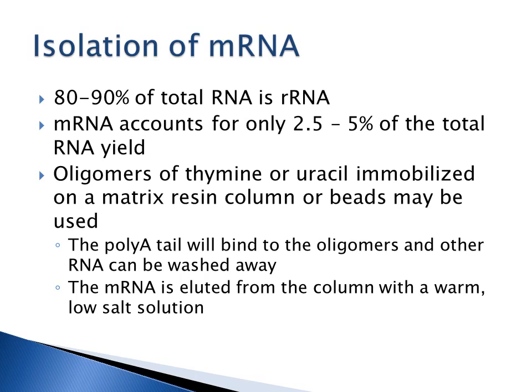So usually you're just going to isolate total RNA, and then you're going to do other methodologies like reverse transcriptase PCR or real-time PCR to look at your messenger RNA and not actually isolate the messenger RNA.